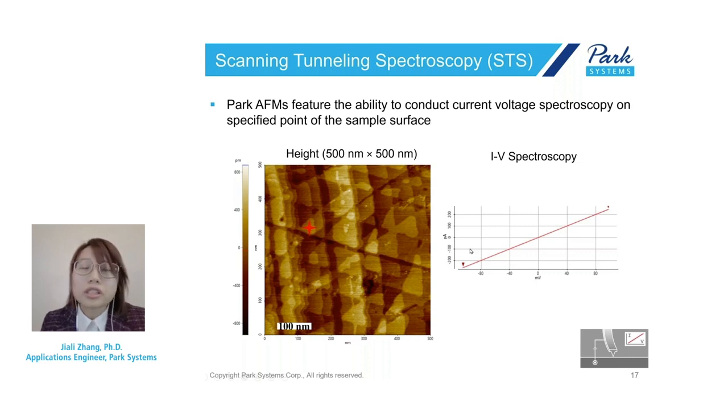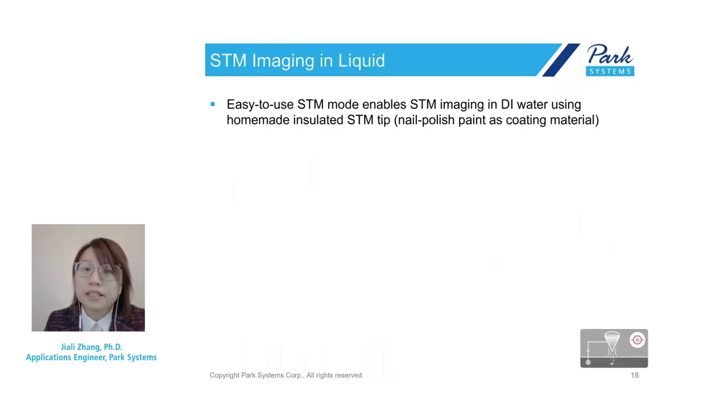Since a lot of researchers and scientists also wish to use high resolution STM to study chemical and biological reactions, which usually take place in liquid environments, I want to show you the feasibility of STM imaging in liquid.